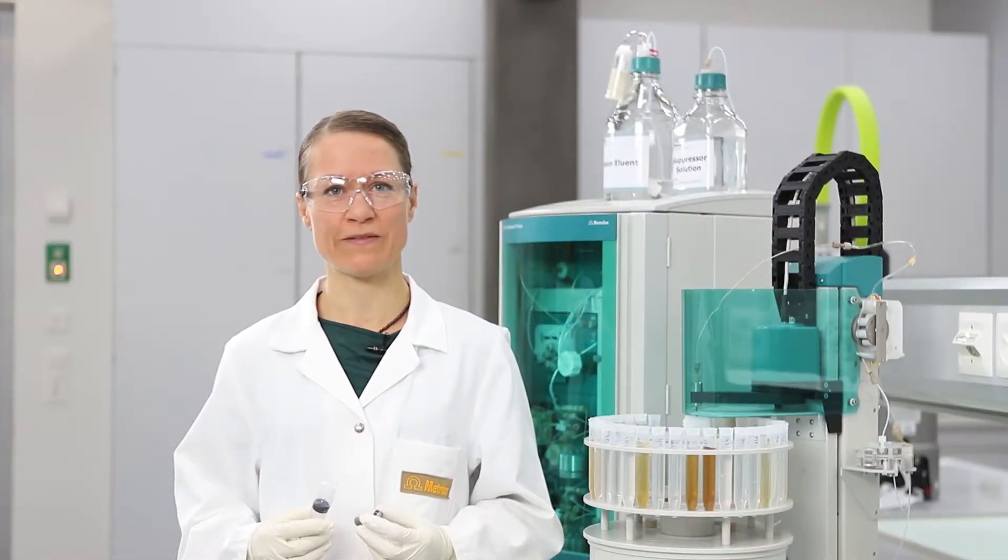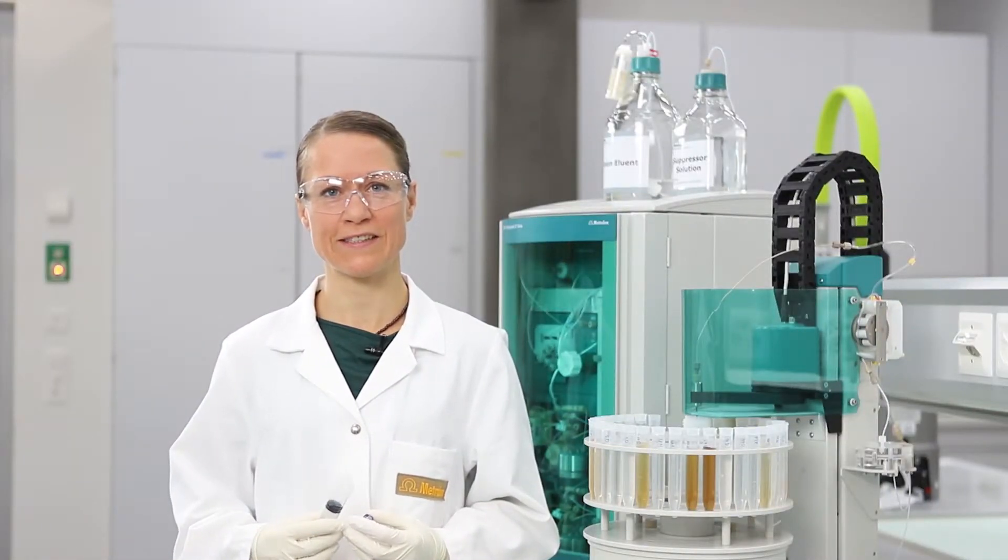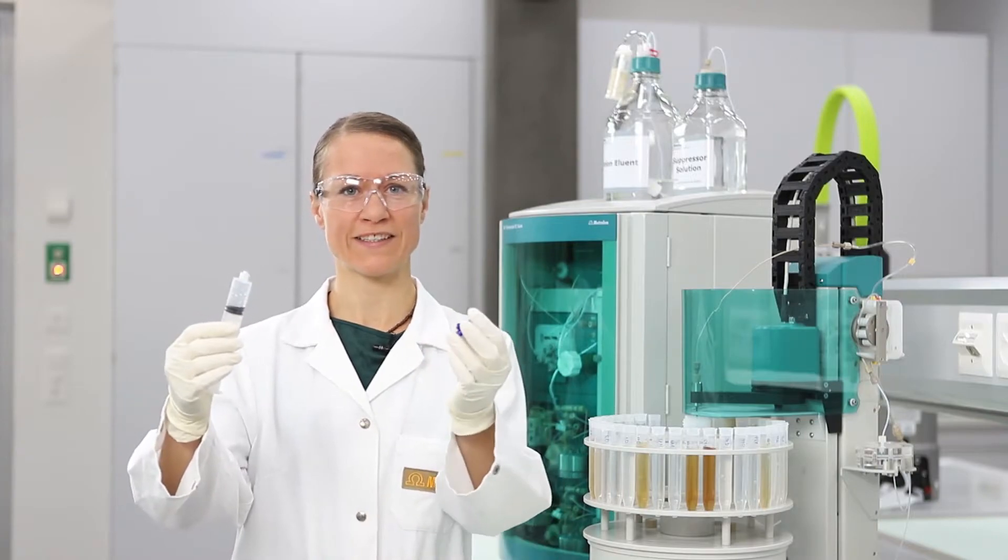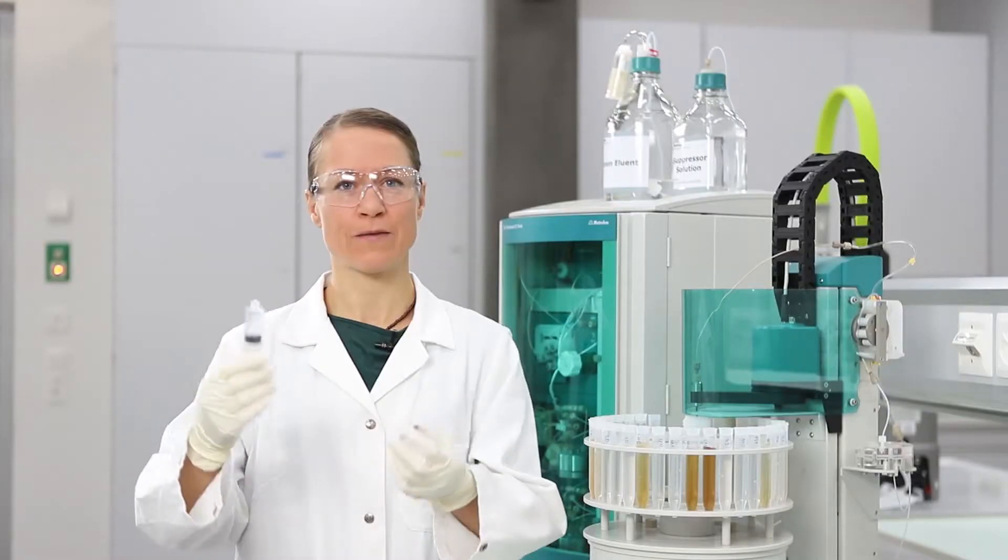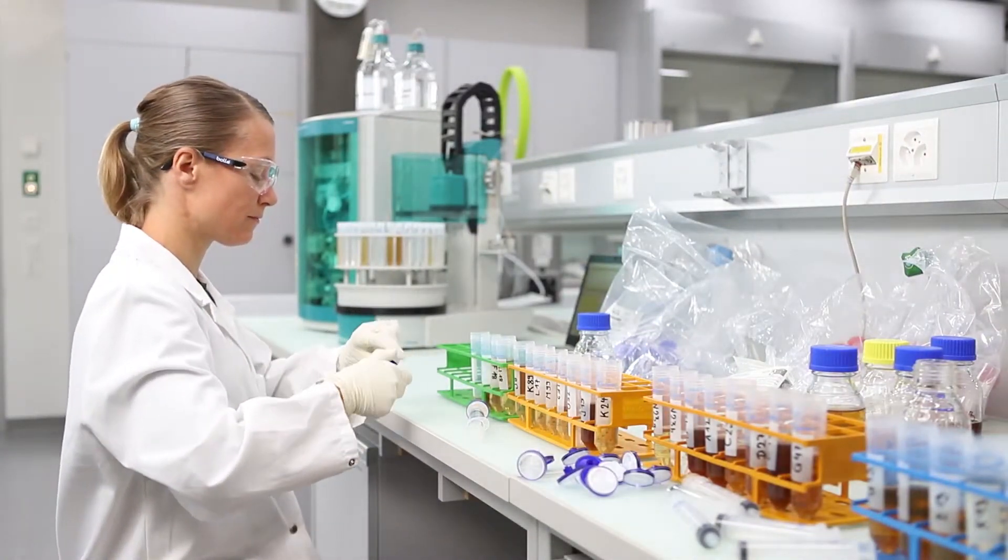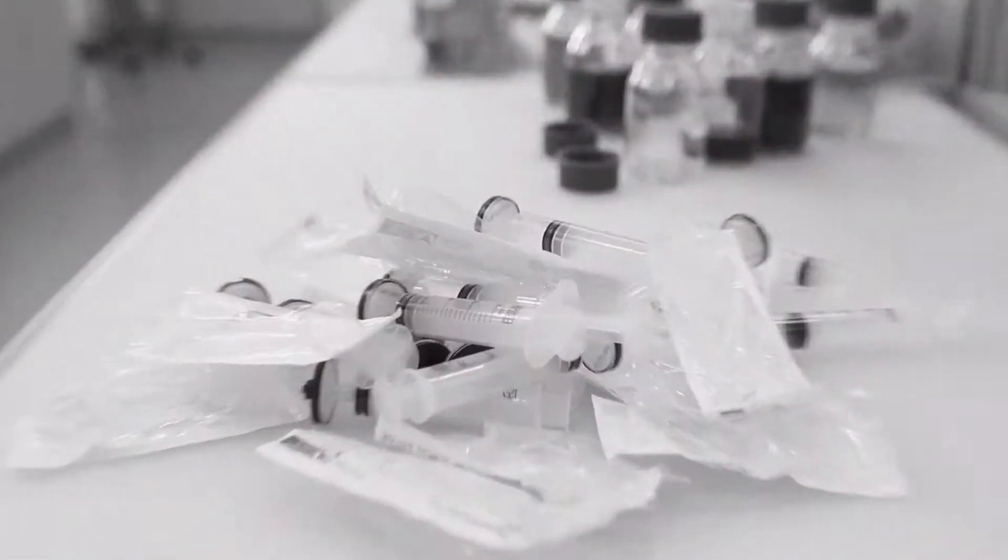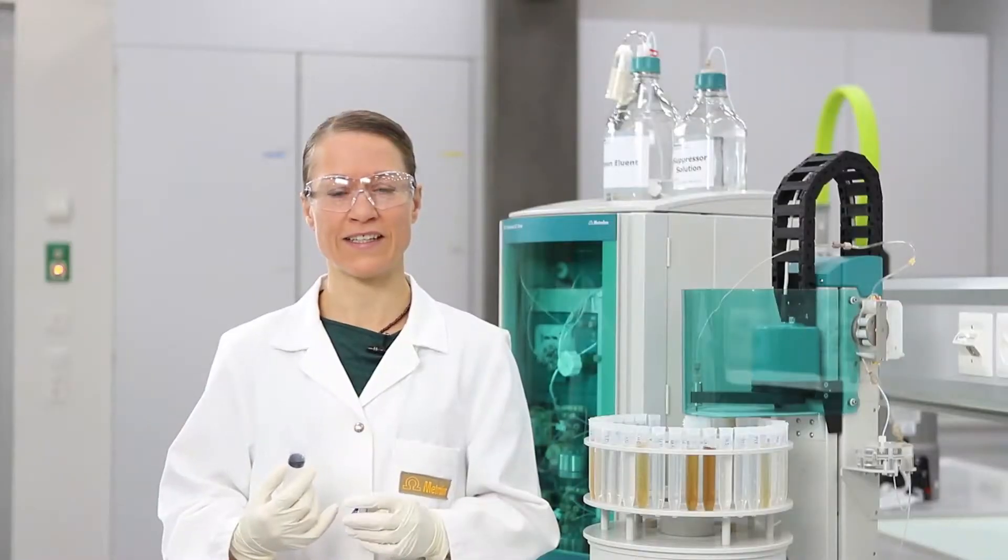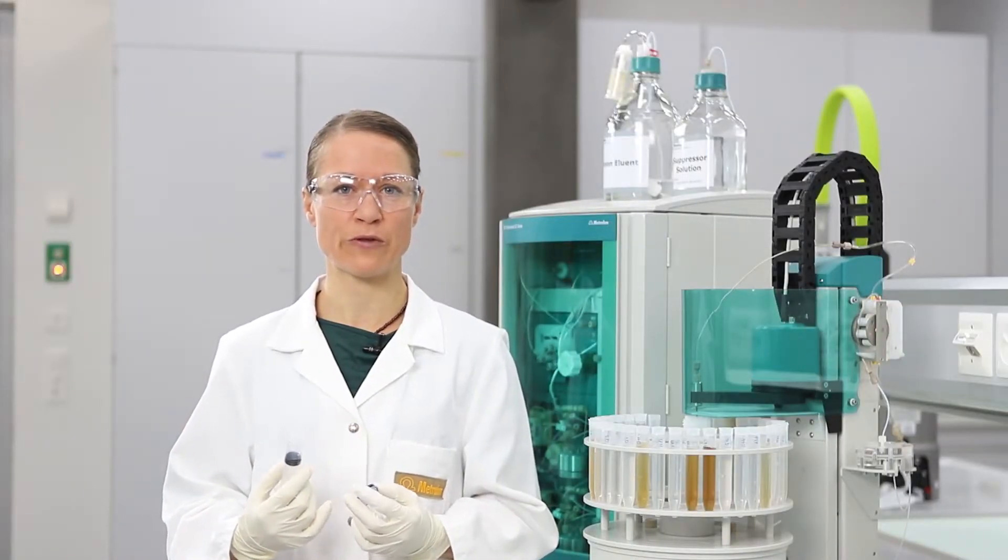If you've ever analyzed samples that contain particles by ion chromatography, you're probably familiar with this and this. Manual filtration is an important cost and time factor for laboratories and causes huge amounts of waste. Today I'll show you how to solve these problems using ultrafiltration.